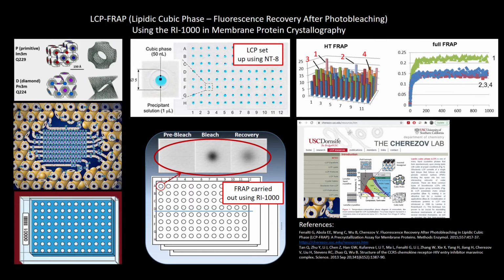Membrane proteins are high-impact, very difficult targets, often requiring extensive screening and specialized crystallization conditions. LCP is often used as a medium for the protein. LCP is lipidic cubic phase, in which lipids form a repeating lattice of a bilayer. Reconstituted integral membrane proteins are able to diffuse and translocate through the bilayer as the LCP drop shrinks during vapor diffusion and come together to form crystals. The crux is that crystallization is dependent on diffusion.